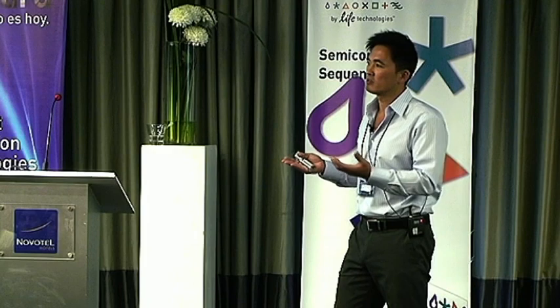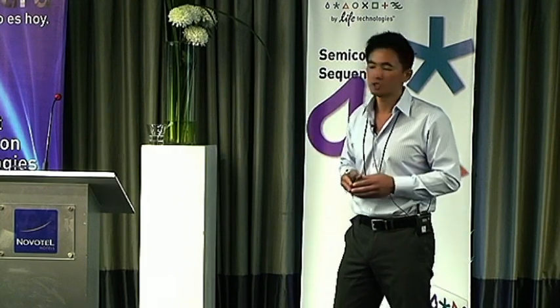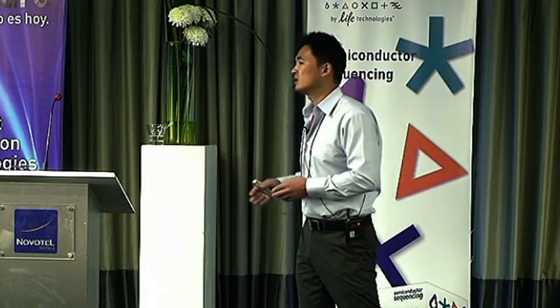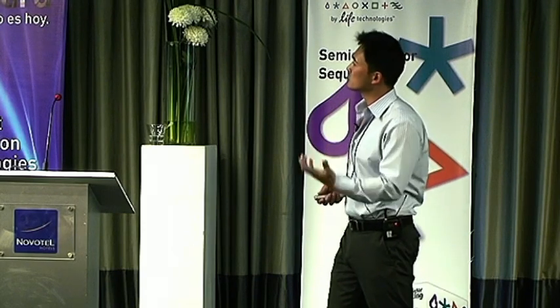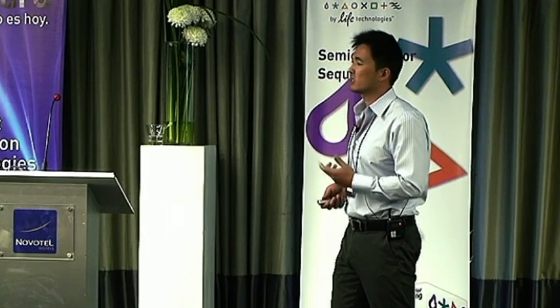What they're trying to show here is that it allows stem cell researchers to go back to their cultures and quickly characterize them, even at different passages. So they're looking at induced pluripotent stem cells and embryonic stem cells, and just using this OpenArray technology as a screening tool, basically to characterize.